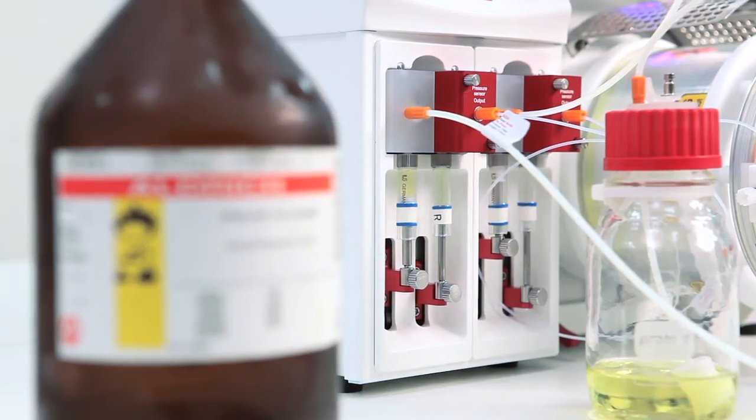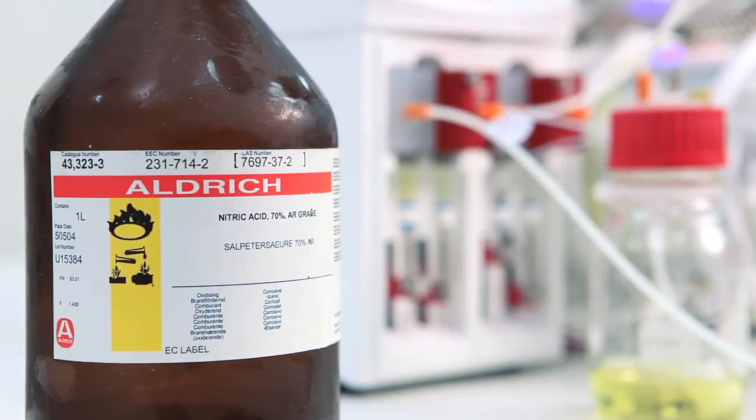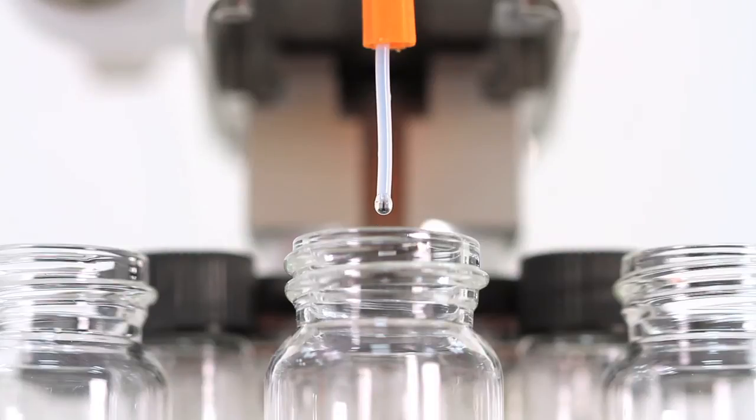Asia makes processes using hazardous chemistry such as nitrations or the use of azides much safer. By only reacting small amounts of material at any instant and having a high surface area to volume ratio, risks are significantly reduced and exotherms are better controlled.